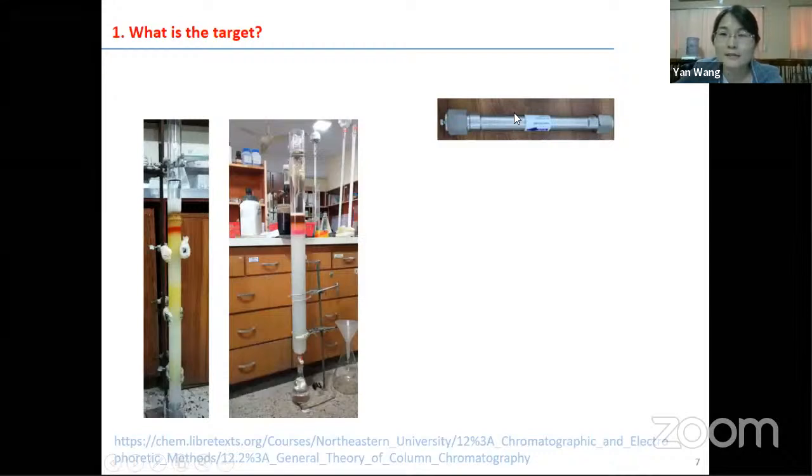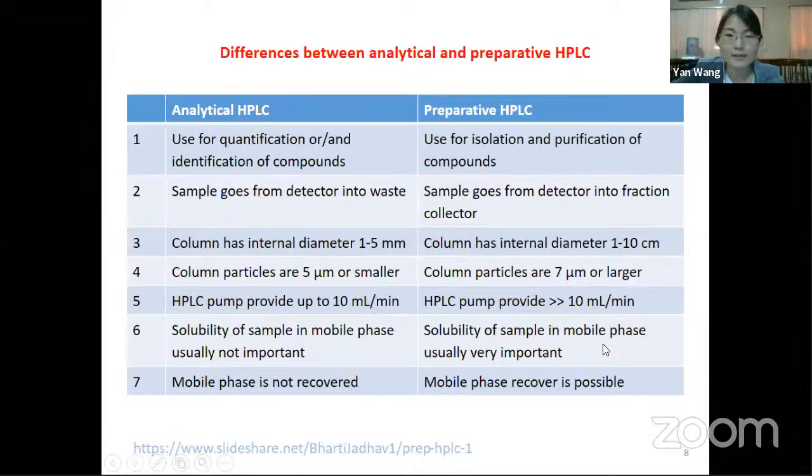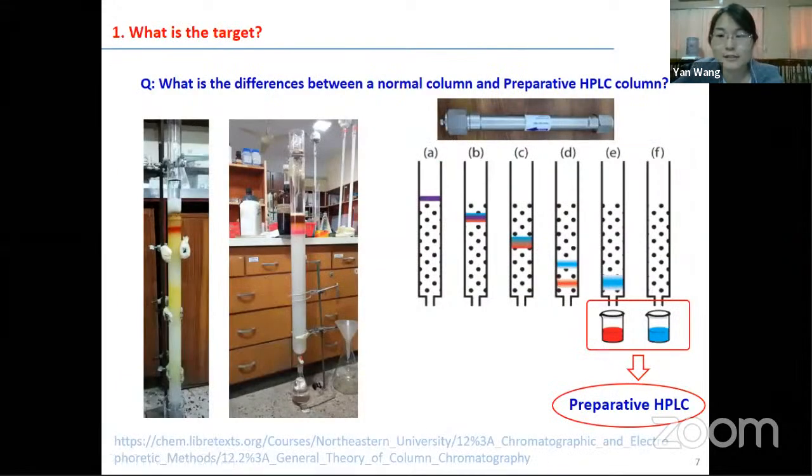What is happening in the preparative HPLC column is not visible, but the compounds come the same way. Only this column looks so advanced and expensive compared to the normal column. But as a matter of fact, it doesn't matter whether it's a normal column or this advanced column, the story is the same, because it's used for isolation. It's used to separate the sample.